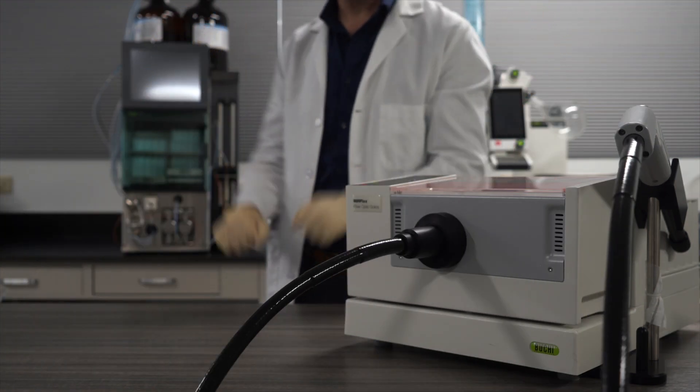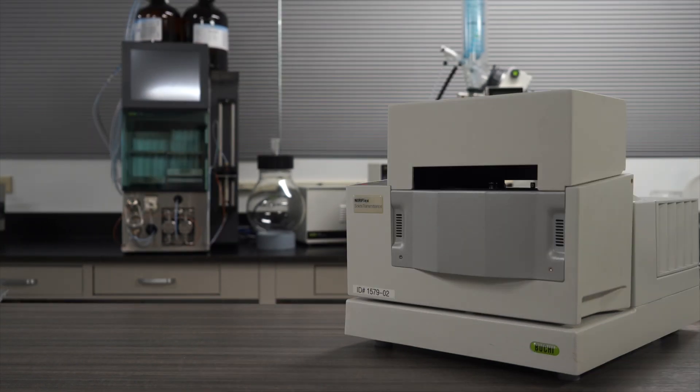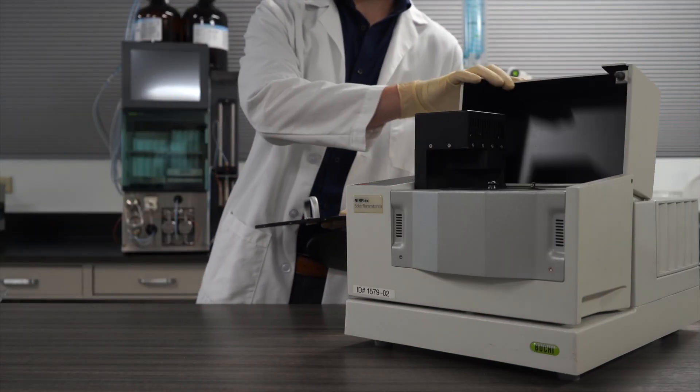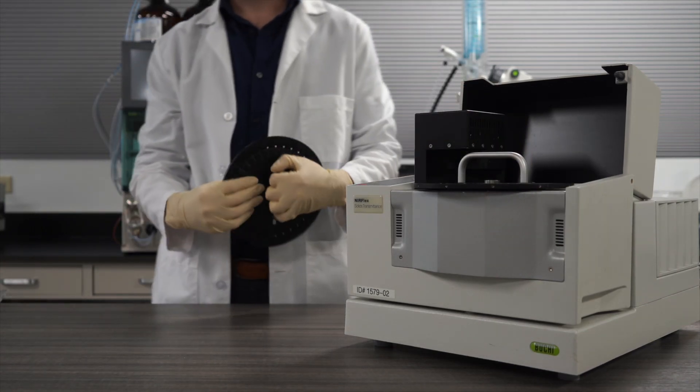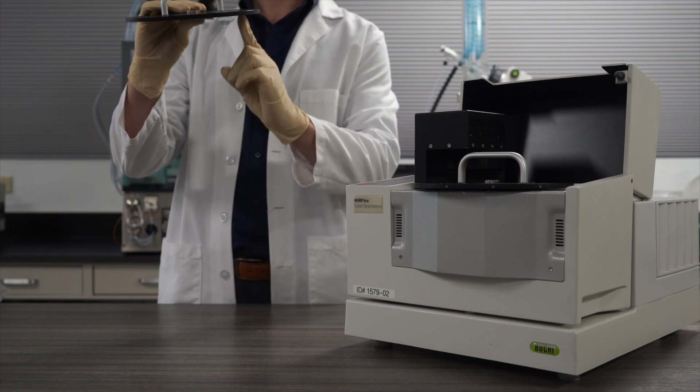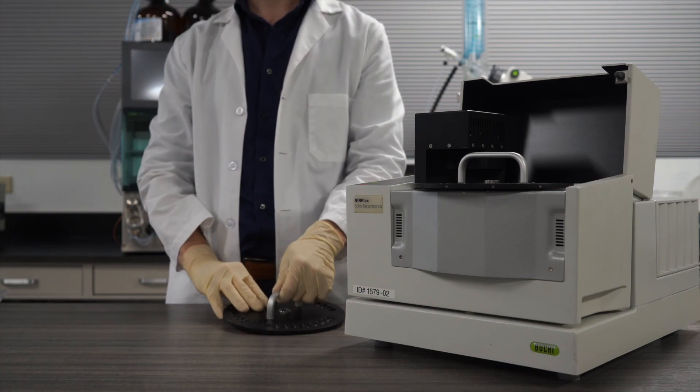But wait, there's more. We also have a solids transmission module specifically designed for measuring individual tablets or capsules. This module uses the principle of diffuse transmission, where NIR light penetrates the sample from one side and is diffracted or reflected to the detector from the other.